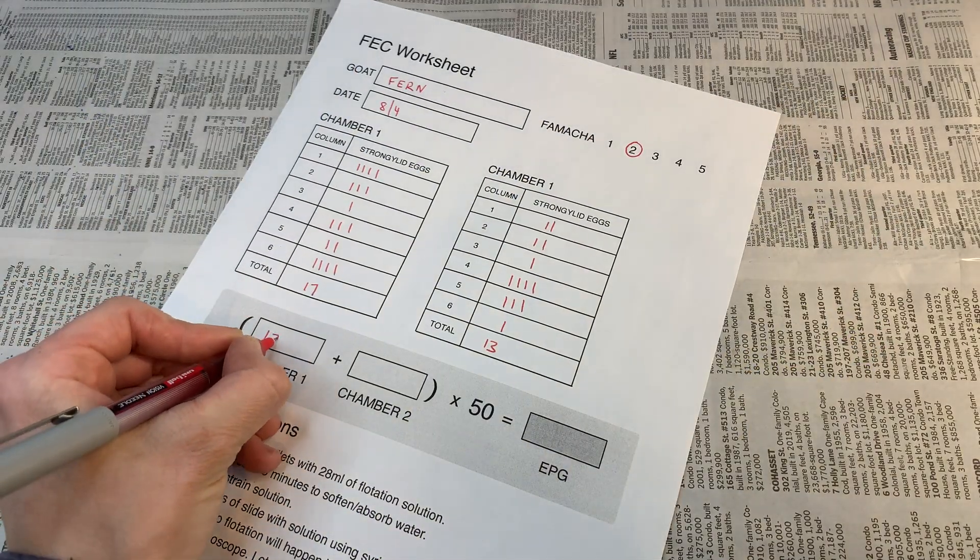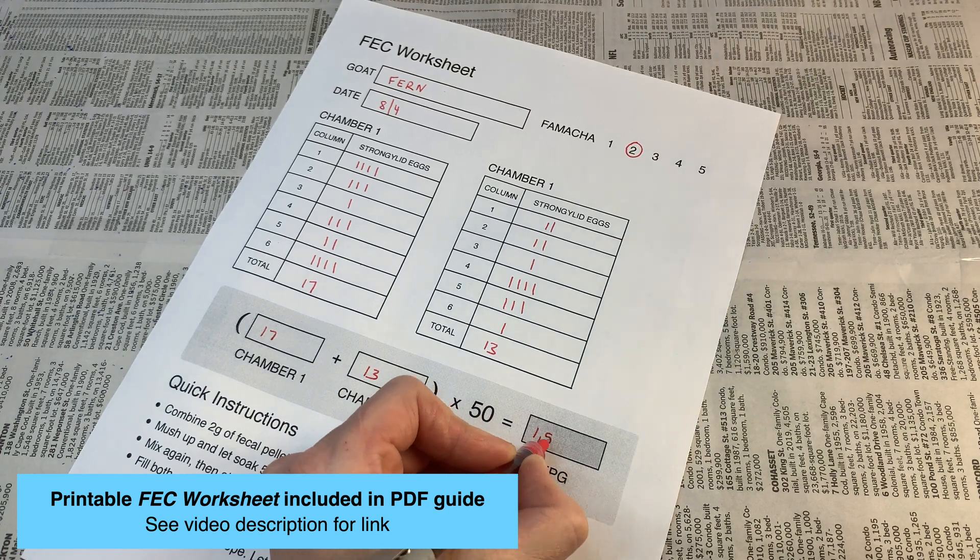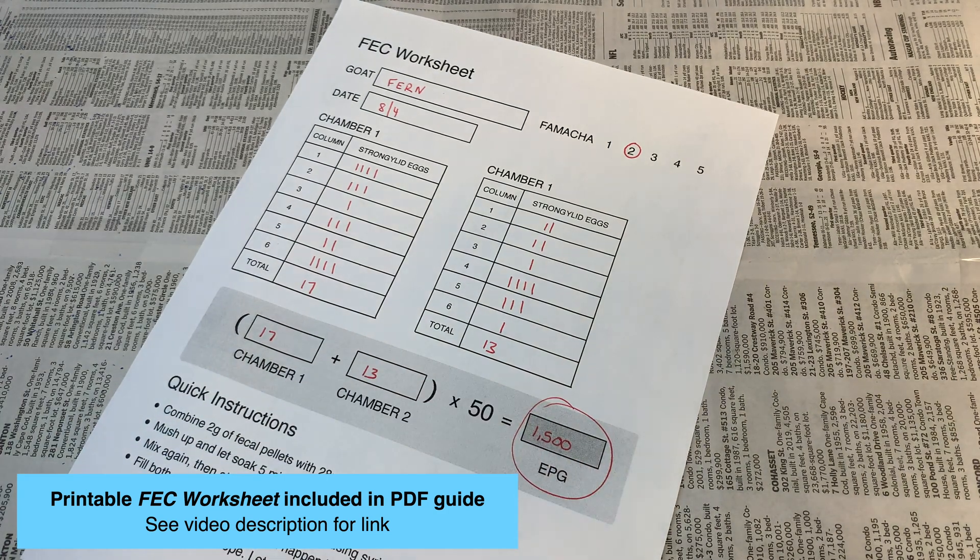Once you have a final count across both chambers, plug the totals into the formula on your worksheet to calculate your EPG, or eggs per gram.